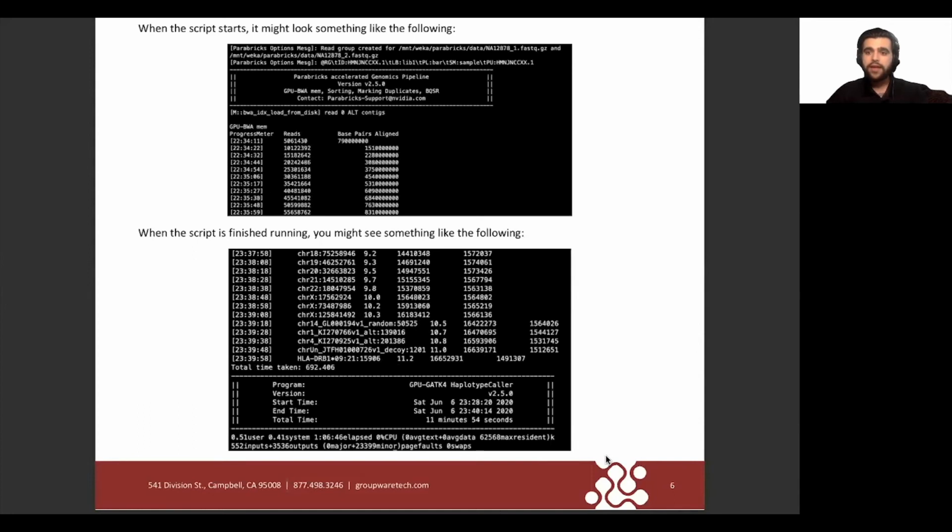I'm going to go ahead and insert a pre-recorded video of the actual run. It took about an hour to an hour and 10 minutes to run, but it has been sped up significantly so that you guys don't have to sit through that.